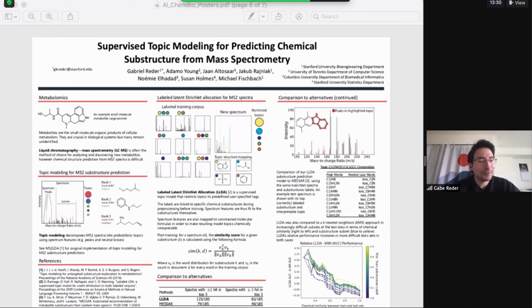The additional benefit here is that now you don't have to go through all that work. You can take a look and say, look, these are direct scores for each one of these substructures, and now I've assigned a good prediction for each one of them. And if I hand you those and you're an expert chemist, or maybe you want to stitch that together in some other way, you can take these different substructure pieces and piece them together to have a good guess as to what the structure corresponding to that MS2 spectrum might be, or at least a very finite number of structural candidates. And then you can synthesize your standards, run them on MS2, and verify.